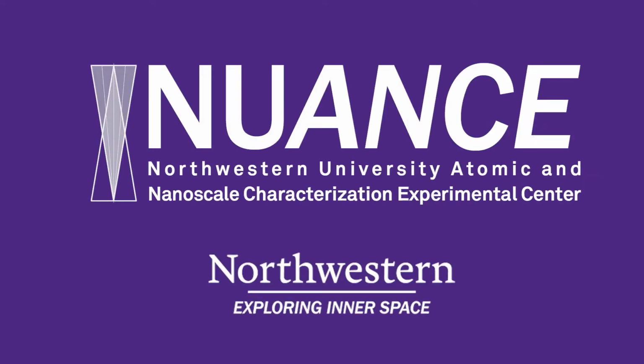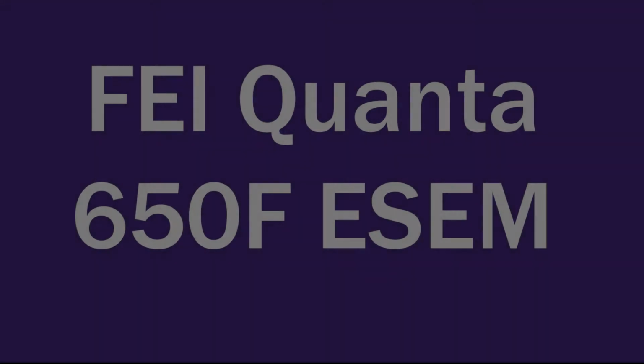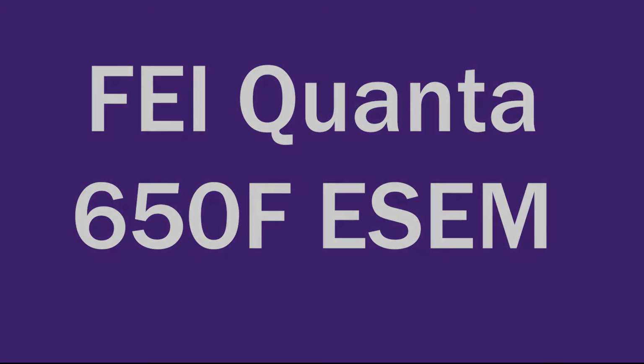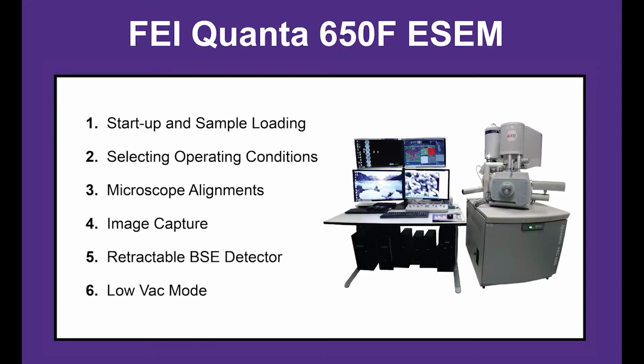This video walks you through the standard operating procedures for the FEI Quanta 650F ESEM. I will be going through the procedures quickly, so please feel free to pause the video at any time. This video will cover startup and sample loading, setting operating conditions, how to capture and save images, how to use the backscattered electron detector, how to use variable pressure mode, and how to shut down the instrument.